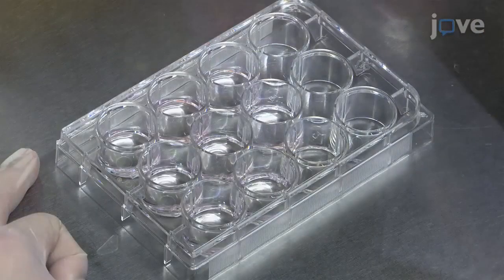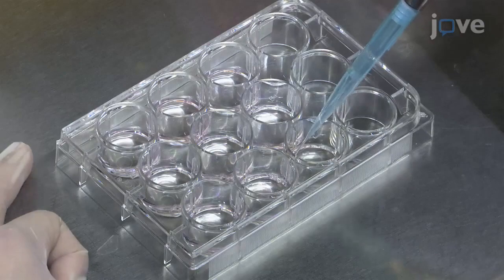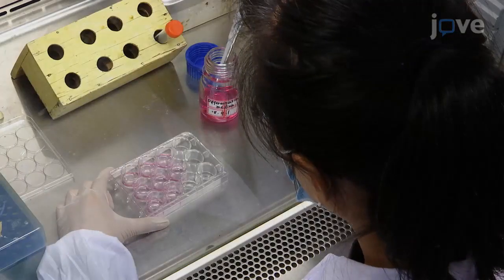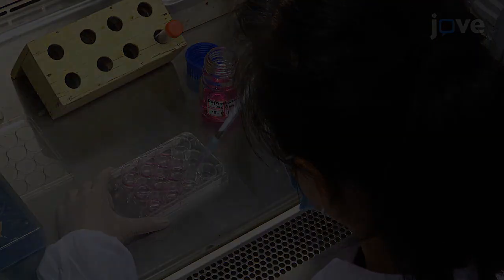When the cells have attached, wash the coverslips two times with 1 milliliter of PBS per wash and treat the cells with differentiation medium for 48 hours.